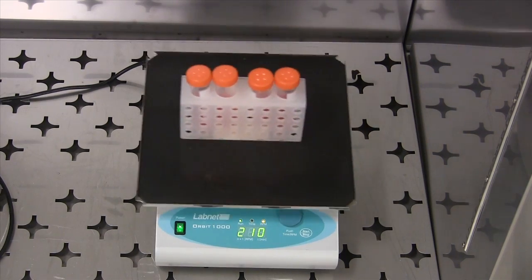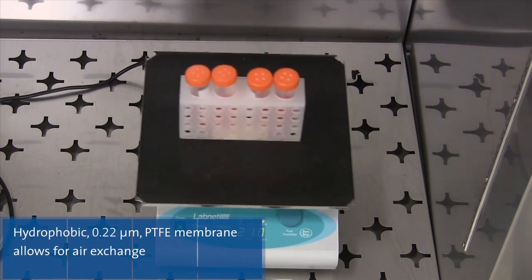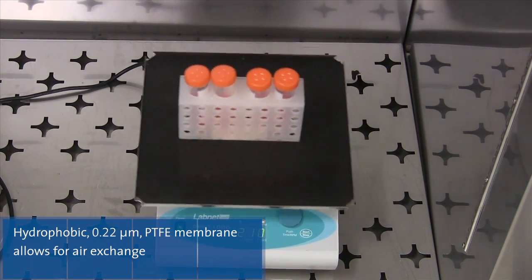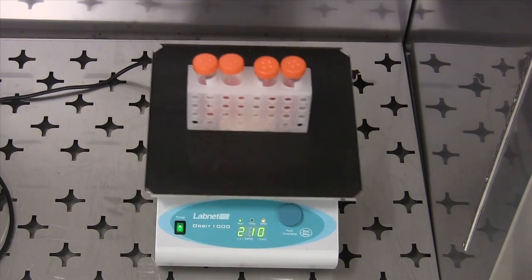The new Corning mini bioreactor consists of a 50mL centrifuge tube with a vented cap. The four openings in the cap are vented with a hydrophobic 0.22 micrometer PTFE membrane which allows for gas exchange.